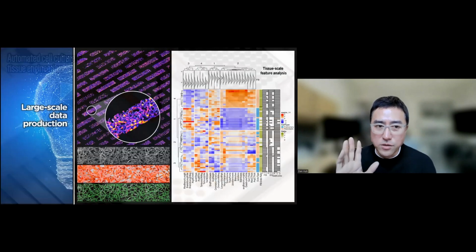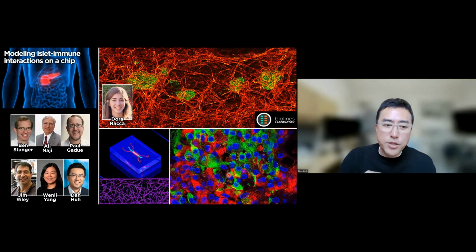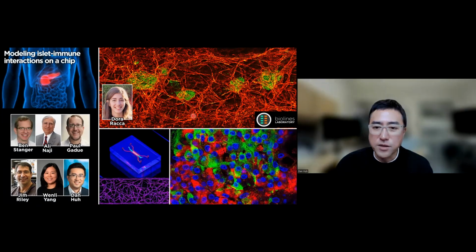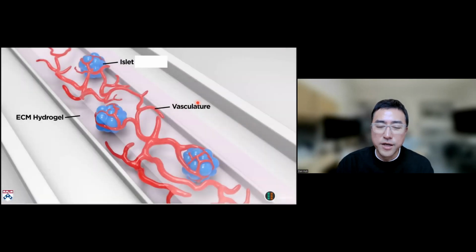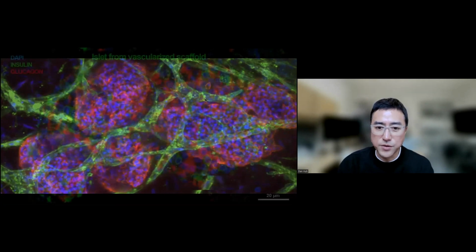Okay, so before I finish, as part of the HIRN consortium, in collaboration with the investigators at Penn shown here, we're creating vascularized human islet tissues. We used devices shown here, and we use the same design to trap liquid hydrogel containing islets and endothelial cells and fibroblasts, and then we gel it. We culture them in this 3D environment to form these vascularized islet tissues.